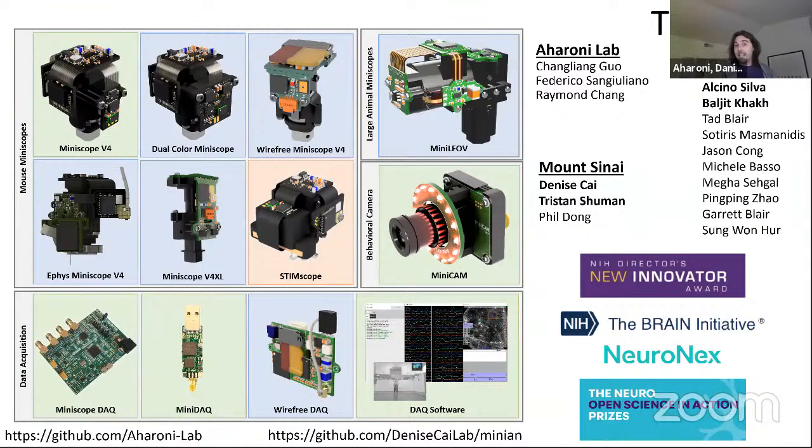Like swap out the filters, and now you can image red instead of green, or look at the other dozen open source miniature microscopes that are built on similar frameworks to understand how you can incorporate some of that into your work. I think that can often lead to better science than being limited to specific tools that are sitting on the shelves in your lab.